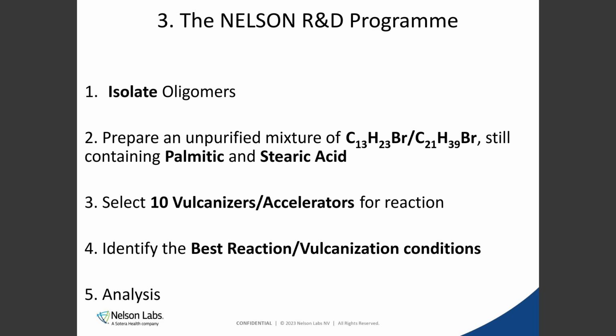And in that way, we would be able to have a proof of the compounds we found in the extractable studies.